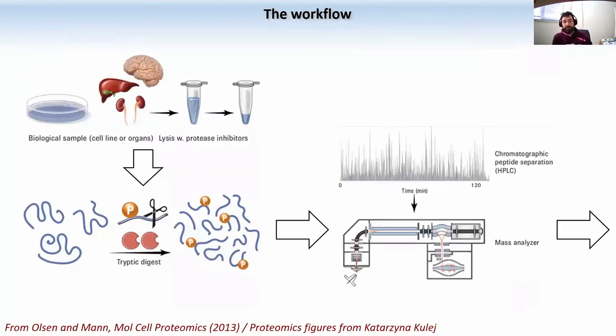And the workflow for proteomics, I'm sure you heard this already, so I'll be quick, but basically you can analyze protein from nearly any kind of tissue or cell type, as long as you can homogenize a tissue and get your proteins in solution. Once your proteins are in solution, the standard workflow is that your proteins are digested with some sort of enzymes to make them simpler to analyze.